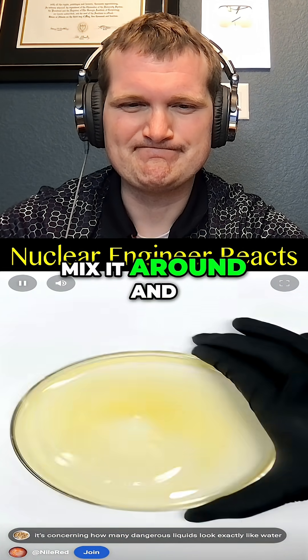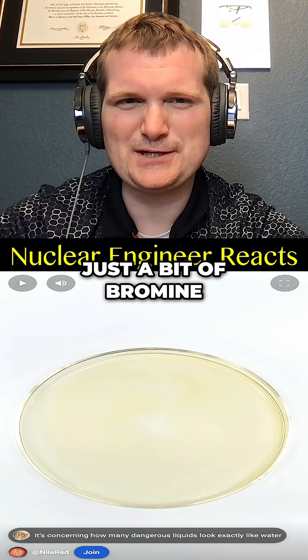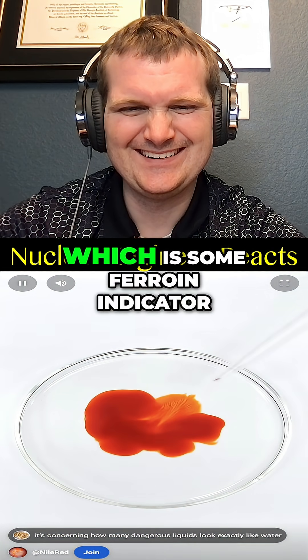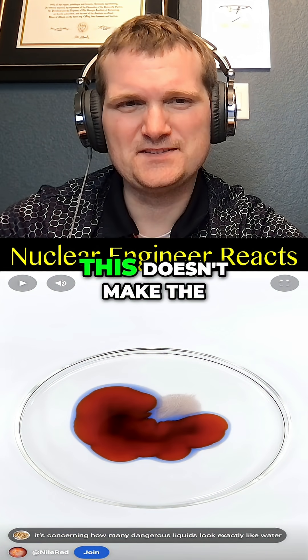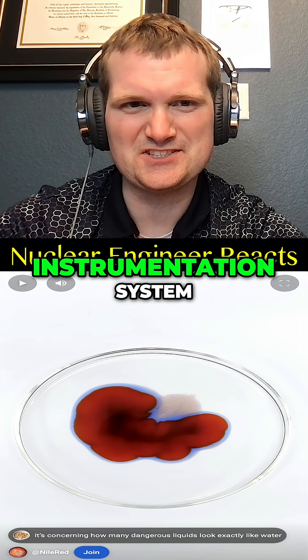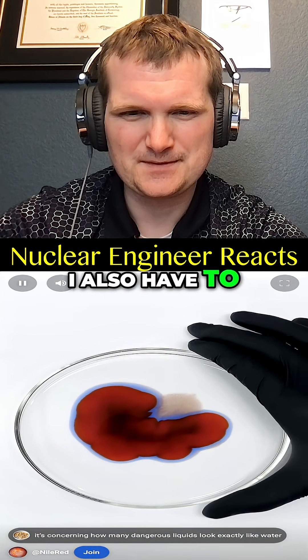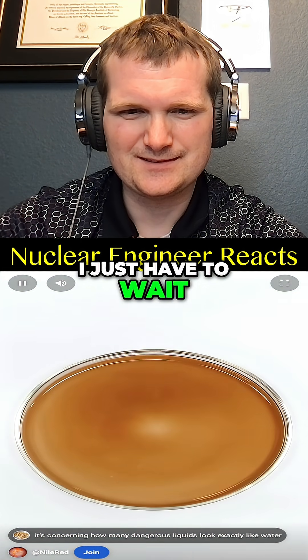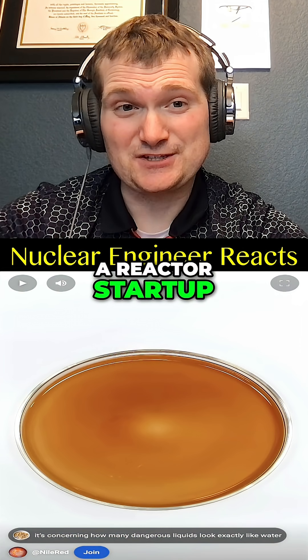I'll have to mix it around and wait for that little bit of bromine to disappear. Once it does, I can add the final ingredient, which is some ferroin indicator. This doesn't make the reaction run, but it's kind of like putting in your instrumentation system so you can see it. I also have to mix this around until it looks pretty even, and after that I just have to wait — the chemist version of a reactor startup. There's a lot of 'do something and then wait' until you achieve criticality.